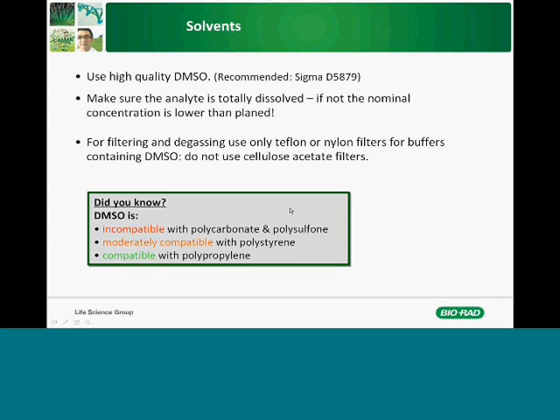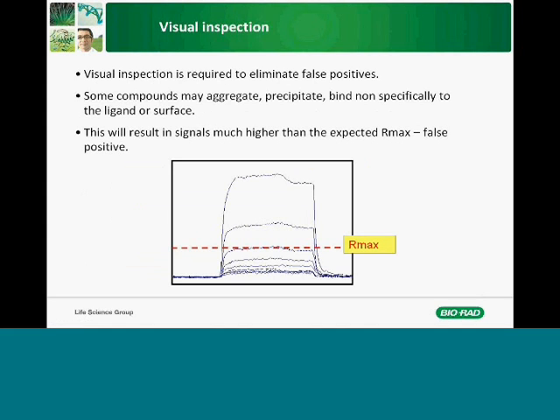And of course, as I mentioned before, visual inspection. I don't always trust the results just by that. Always have a visual inspection.